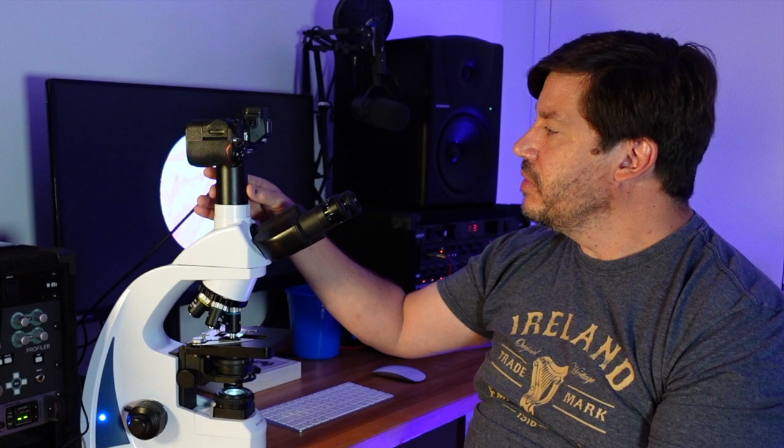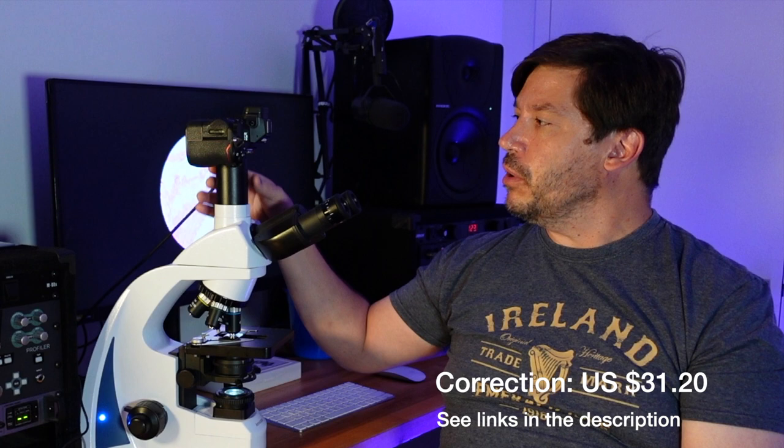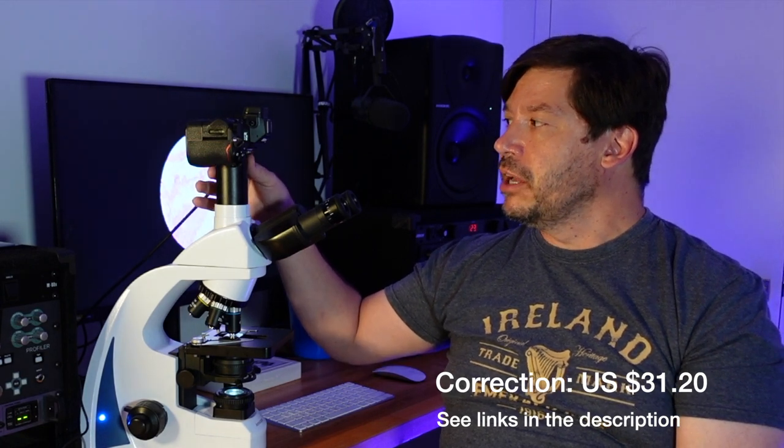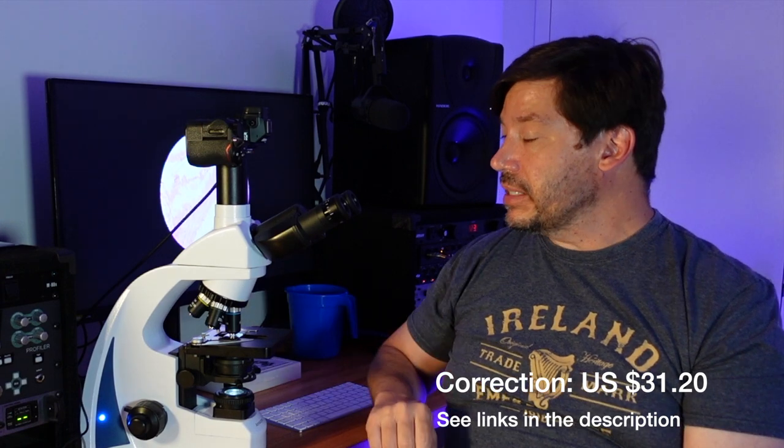So what does all this cost? For the photo tube, with all taxes applied, it got to my home at $182 — that's pretty expensive. The C mount that goes onto the camera itself is less than $30, so still it's pretty pricey. We're at about $210–$211 for this system that will allow you to get images from this Amscope microscope onto a Nikon mirrorless camera.